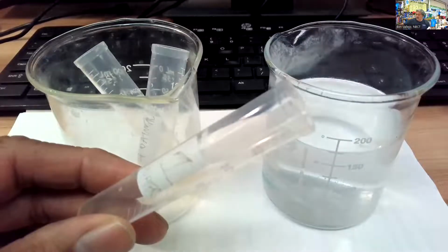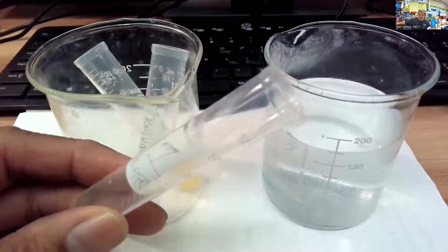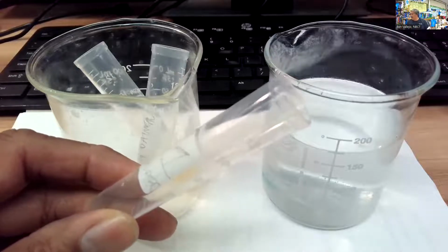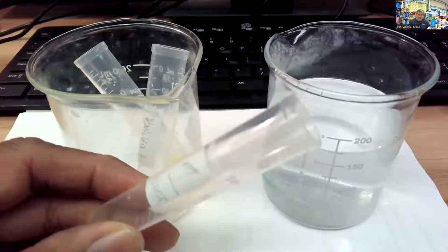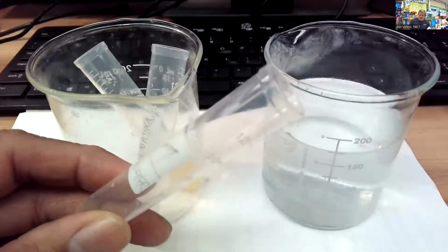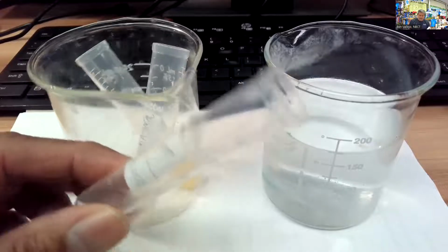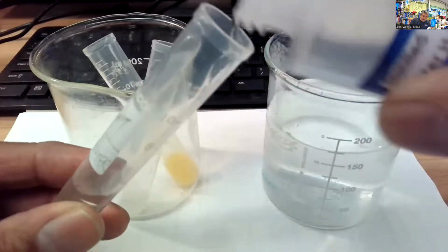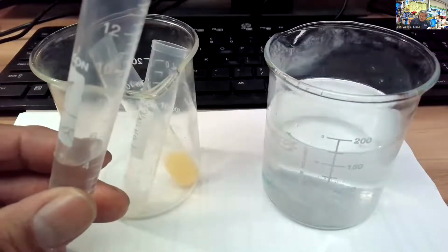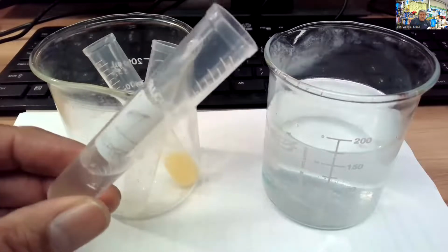This one is water. So I'm going to take my water and add some water to this test tube. So here's the water right here. And if I wanted to be precise, I could count 20 drops, which would equal 1 milliliter.